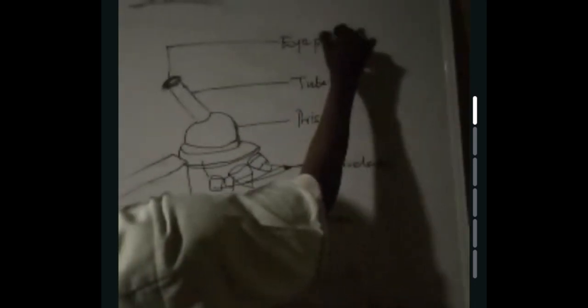Okay. Let me choose this place. There is a very important thing here. What's that? This thing. Eyepiece. Eyepiece, thank you.